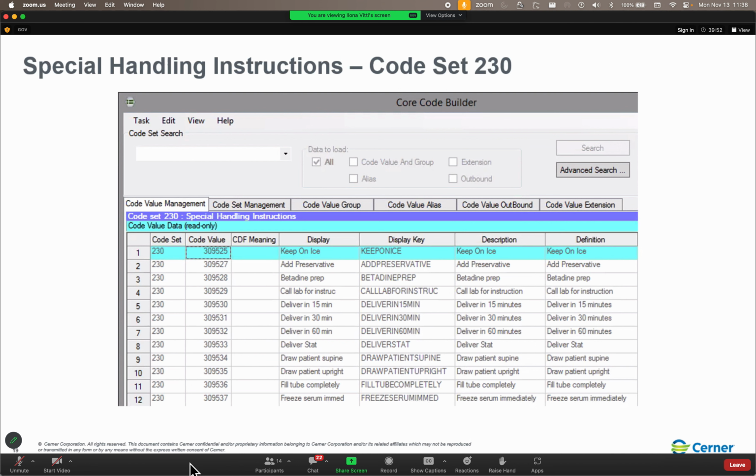So I'm going to go ahead and refresh my screen one more time. Okay, I had people that gave me green check marks and they took them away, but with 13 values out here, I think we've got everybody's build. So now I'm going to refresh the code set. Now, in order to do this, it is going to check your front end security, and it's going to check to see, does your user have the security to be able to refresh that code set? So in this case, I've just refreshed the code set.